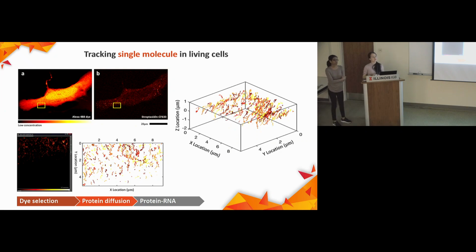So two questions, I guess. Following off of that one, if you're able to track multiple molecules at one time, does it imply that you have multiple beams, or is the same beam being used? No, I think that was a confusion. You can only track one molecule at a time. Oh, okay. You track them one after the other. Yes, it's sequential. I was also thinking about whether there are multiple beams. Got it. That makes sense.